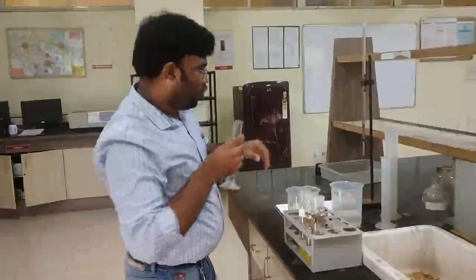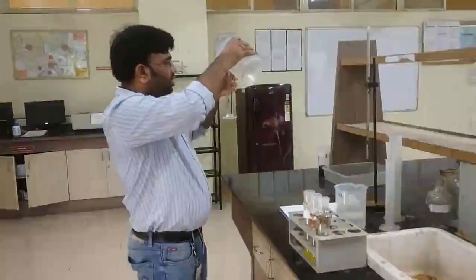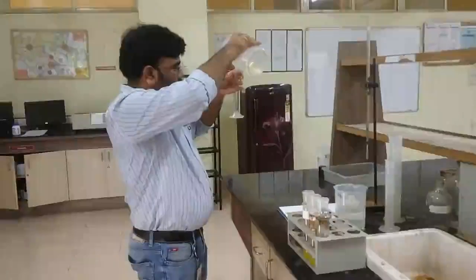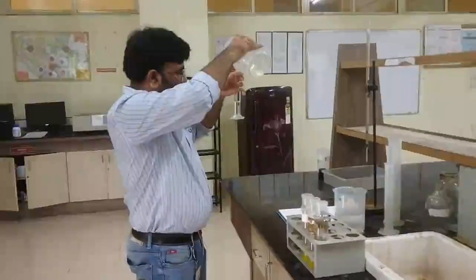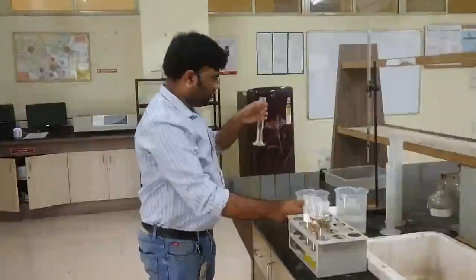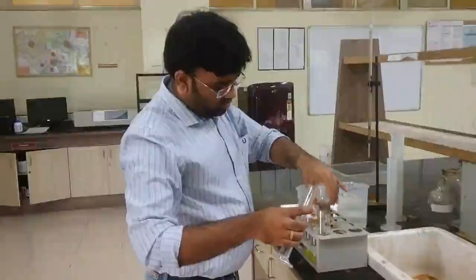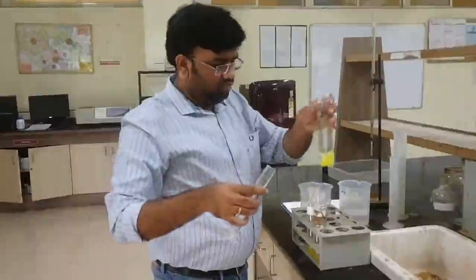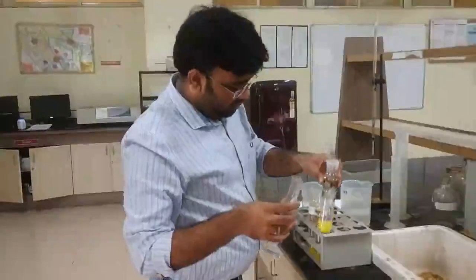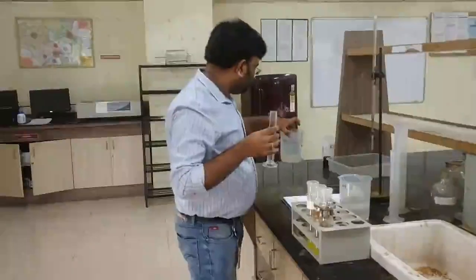The dilution that is adopted is 1, right? We haven't written any tag. So if there are different dilutions, you can tag this COD flask, put a sticker onto it regarding the dilutions and the flask number. We added the sample in each of these flasks.